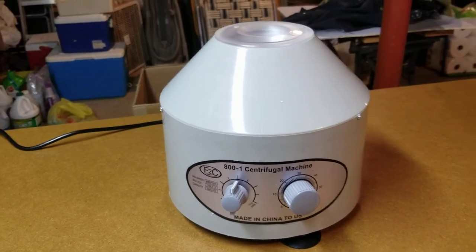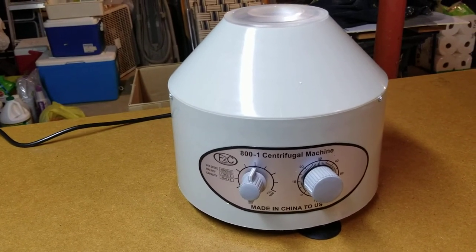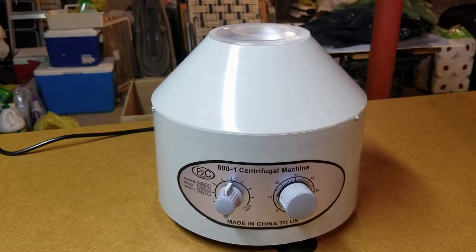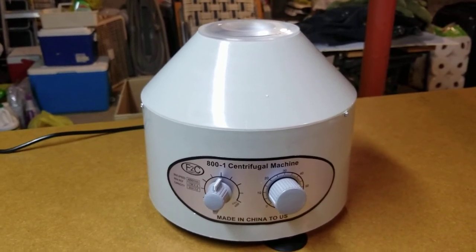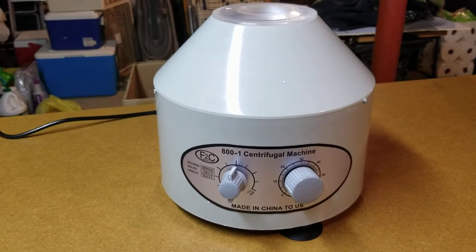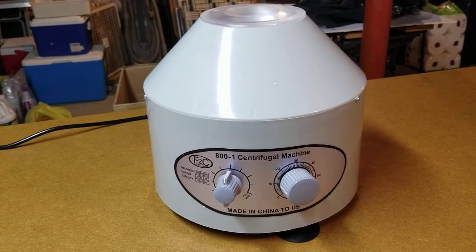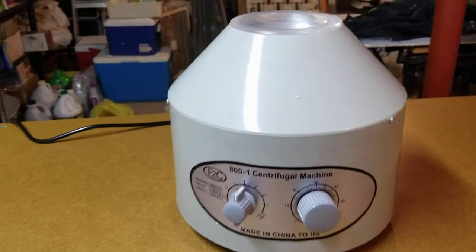I didn't know how long to run it or at what speed, so I guessed and set it for 2000 RPMs and 10 minutes, and it worked out fine. The water that got separated was mostly clear — minimal cloudiness, nothing that would interfere with a colorimetric test such as a pH test, nitrogen, potassium, or phosphorus test. So basically you make your soil slurry and 10 minutes later you have your soil solution ready for testing.